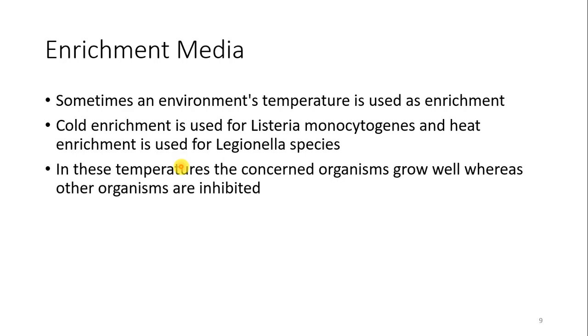Listeria monocytogenes can grow at a lower temperature, while most microbes grow at room or body temperature, whereas Legionella species grow at a slightly higher temperature, while other microbes cannot survive at those higher temperatures. That is why temperature can also be used as an enrichment medium.